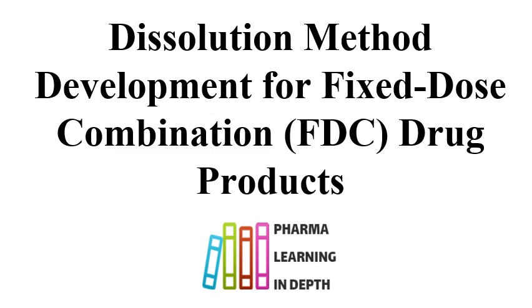Sometimes the capsule may contain pellets with different release profiles, so that is also required to be considered. Based on the experience, the knowledge, and the pharmacopoeial methods, you can start development of the dissolution method for FDCs.